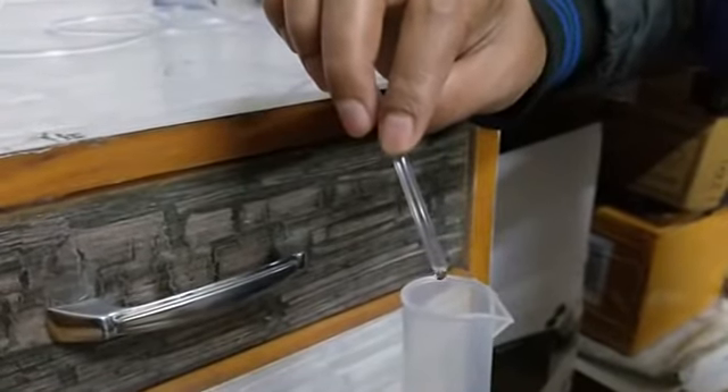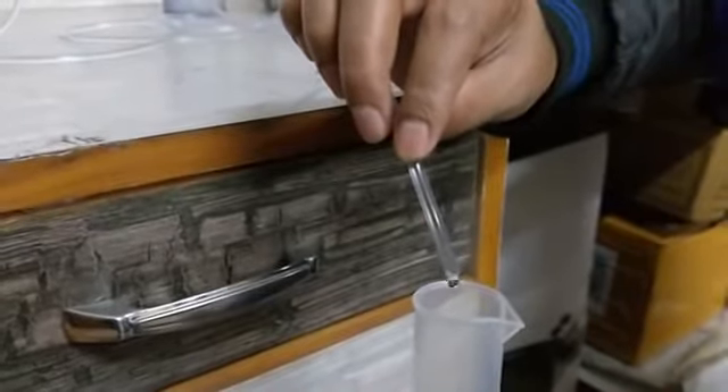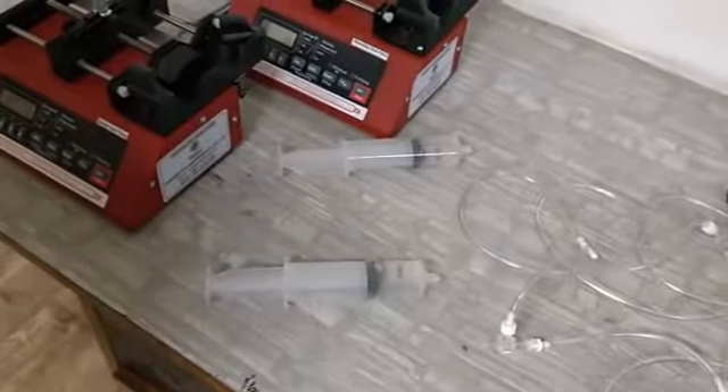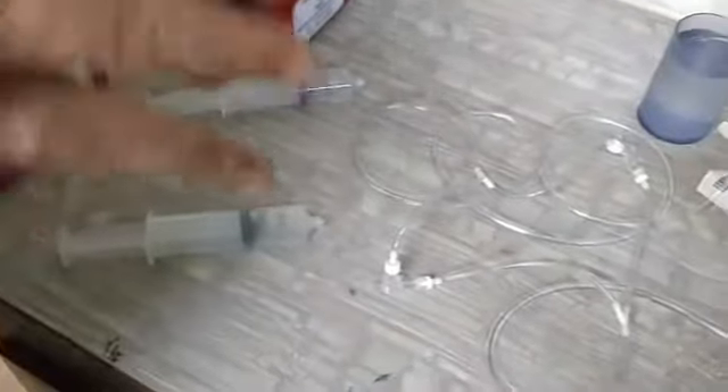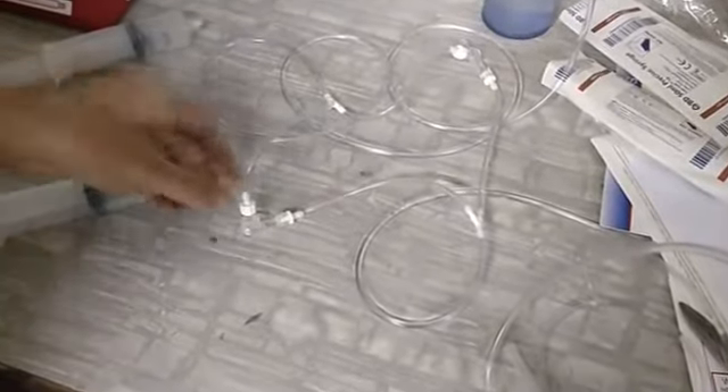Now we will show you how to set up the pump for dual mode. We just saw how the pump works, and now we are going to explain how to configure the machine so that it can work in dual mode.